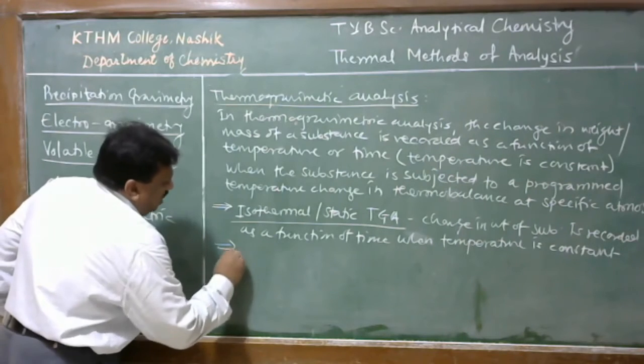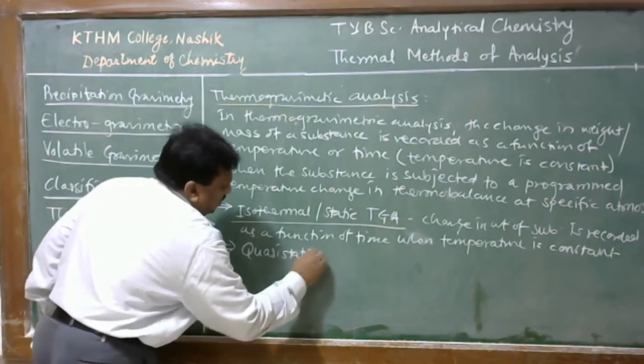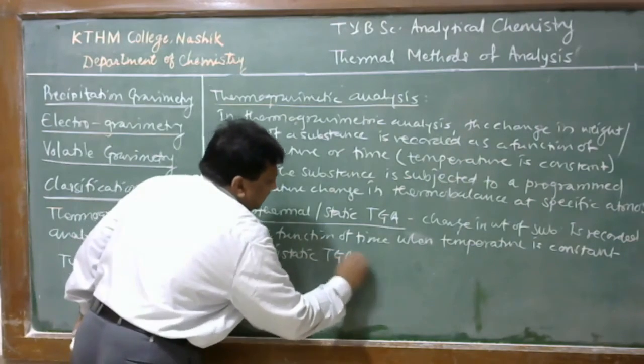Second type is called quasi-static thermogravimetric analysis.